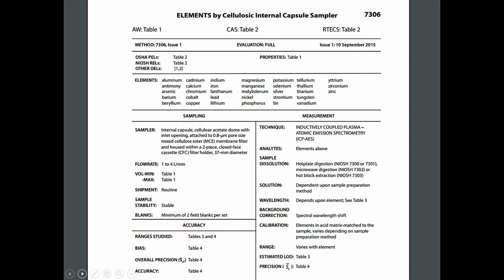If we look strictly at gravimetric, the Accucap with a PVC filter basically accomplishes the same thing that we get from the IOM, in that with the IOM, the filter and cassette are weighed together. So there is no concern over cassette wall losses. Anything stuck to the side of the cassette is weighed.